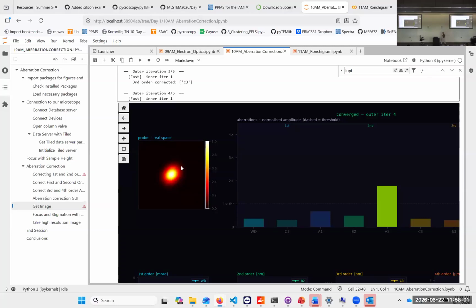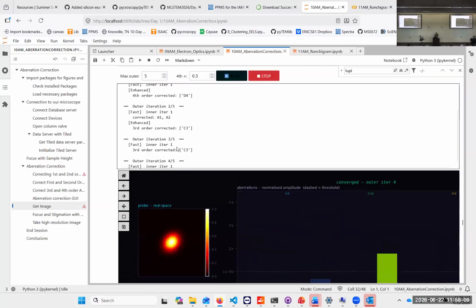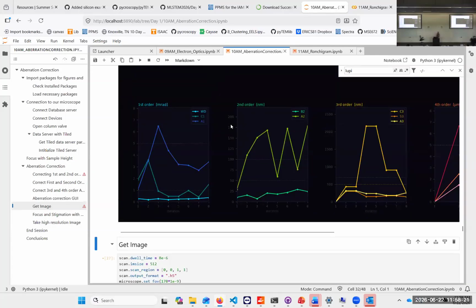It's 45 degrees. And before it corrected it, and that's where it stopped. So we can use that, and we should use that in our microscopy. And the better the microscope is aligned, the better. Might not change too much on your images in terms of spatial resolution, but it gets you to a higher contrast, and that's what you really want. So you see more interesting features in your microscope.